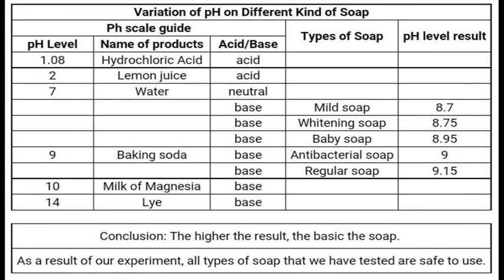The result shows that all the soaps that we used in our experiment vary in pH, and also all the soaps are safe to use in our daily routine.